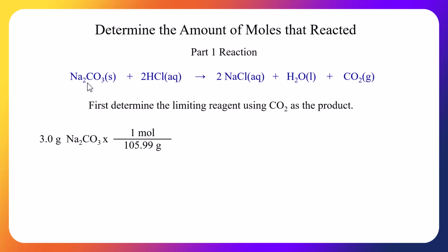Now, I know that for every 1 mole of sodium carbonate, I have 1 mole of CO2. So I go from 1 mole of sodium carbonate to 1 mole of CO2. That gets me to moles of CO2. And then I'll calculate that, and that'll be your answer to question 5.